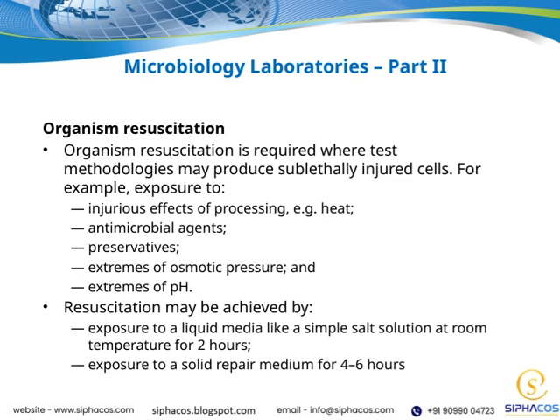So, to accurately assess the presence of viable organisms, we need to resuscitate these injured cells. There are a couple of common methods for this. One way is to expose the cells to a simple liquid medium, like a salt solution, at room temperature for about 2 hours. This helps the cells recover from injury. Another approach is to use a solid repair medium, which generally requires a longer incubation time, about 4 to 6 hours. This method provides a more supportive environment for the injured cells to recover and grow so we can detect them accurately.